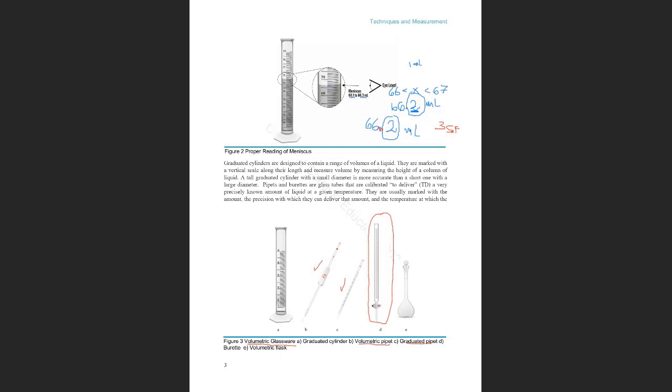It's also a tube, and this is a stopcock that you can open and close. So if you want to measure an amount of water, what you do is you put the liquid here, right? You use a little funnel, and you put the liquid here. And let's say initially, this scale goes from up to down. It increases going down. So if you have a liquid right here, let's say it shows you 1.2 mLs.